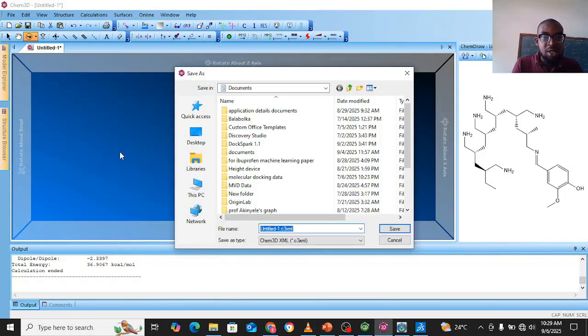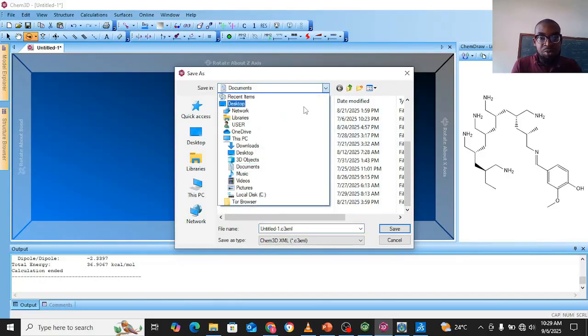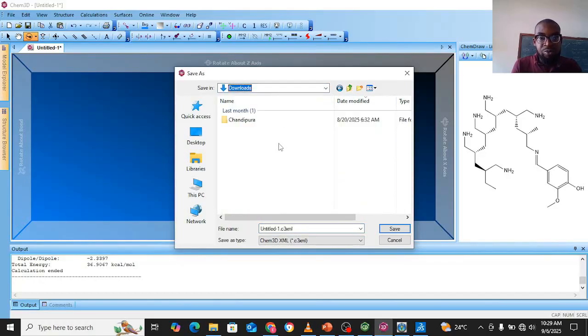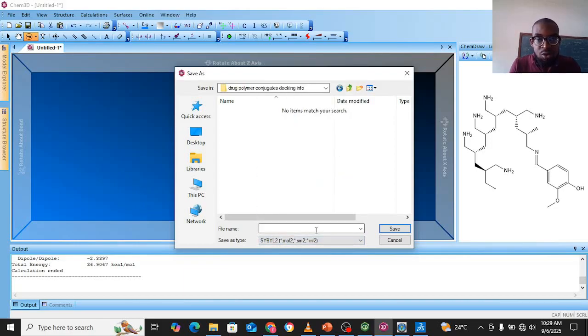I'm going to be saving it as a mol2 file. Don't forget, you save this as a mol2 file. So come here, this is mol2.